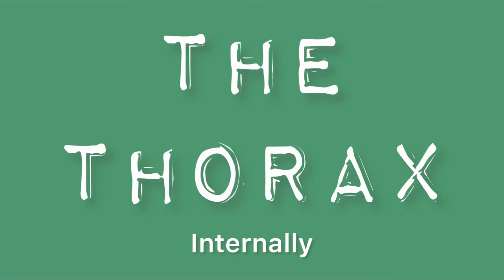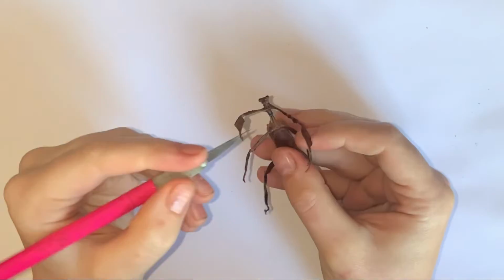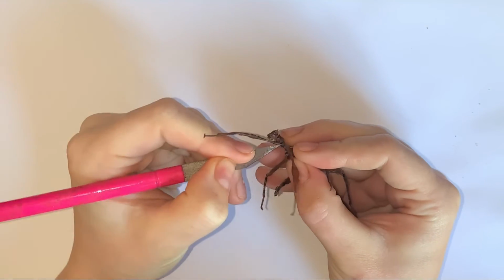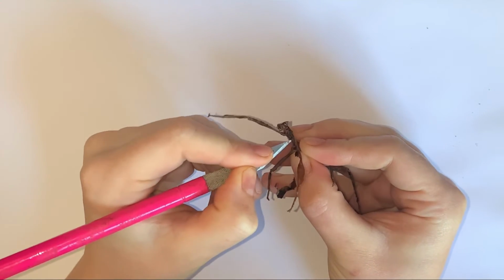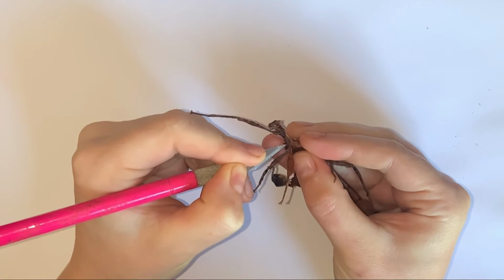Now let's move on to the thorax. To observe the internal anatomy of the thorax and abdomen, carefully cut the lateral sides of the insect from the prothorax all the way down to the anus, and then carefully peel away the ventral body.